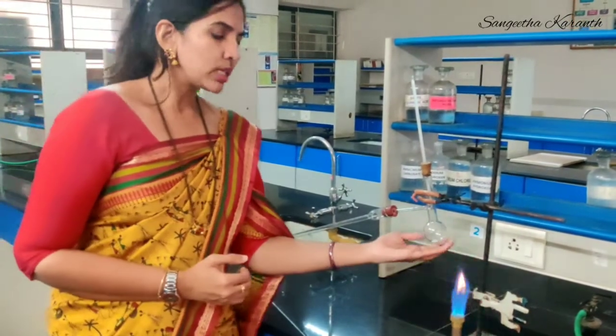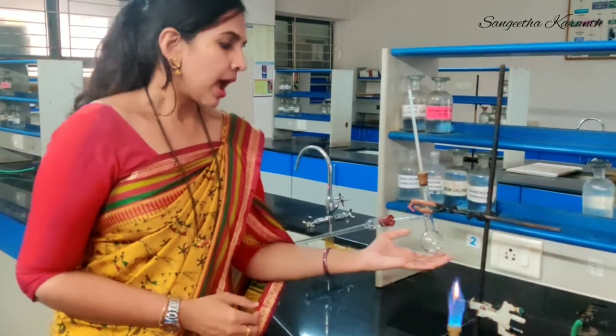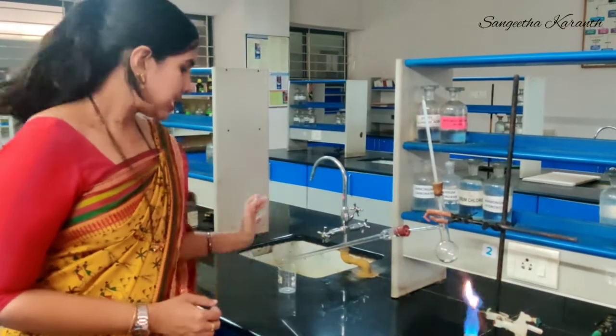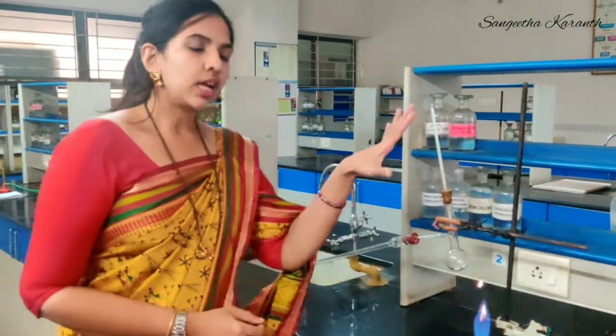In this round bottom flask we fill the given organic liquid, and then it is heated using the Bunsen burner. The liquid will be collected in this beaker at the bottom. So these are the requirements for this experiment.